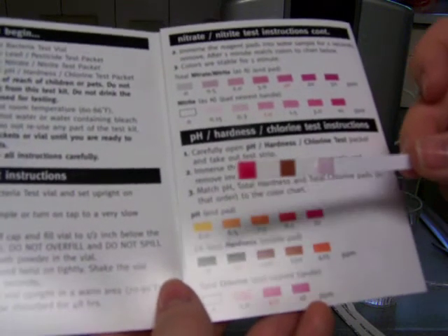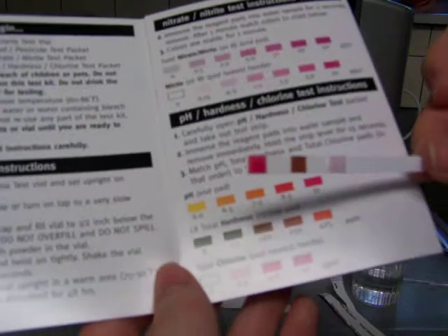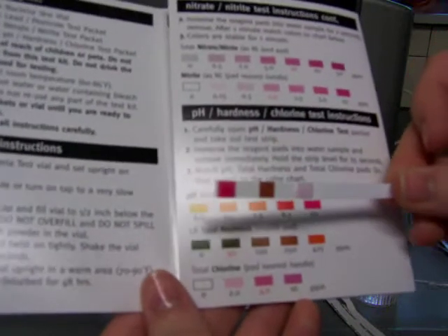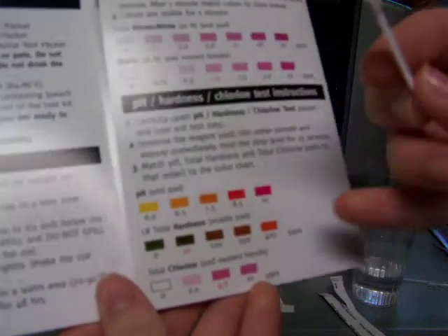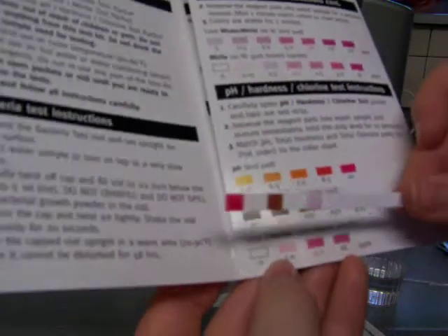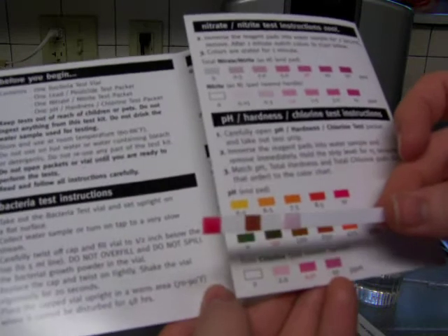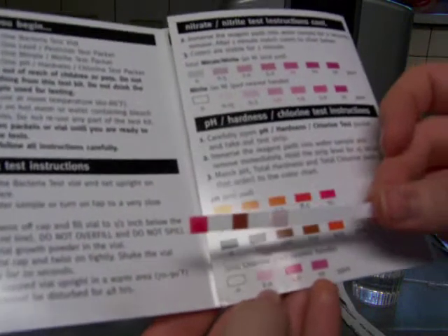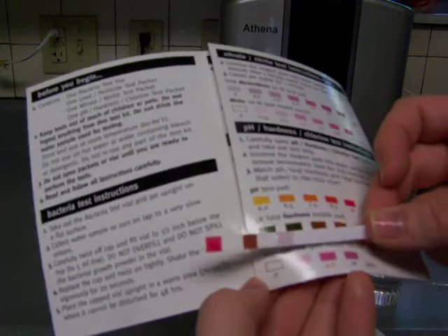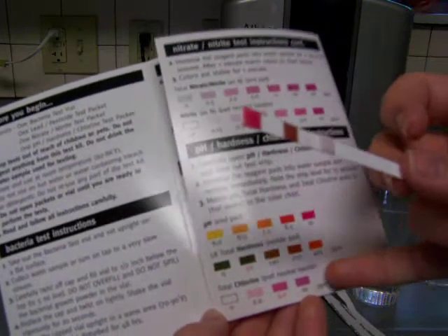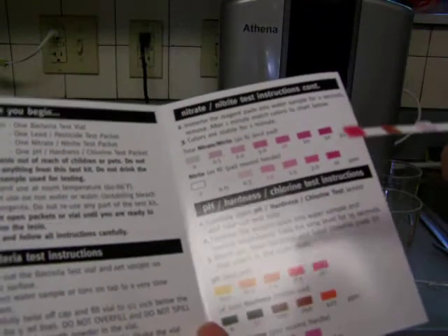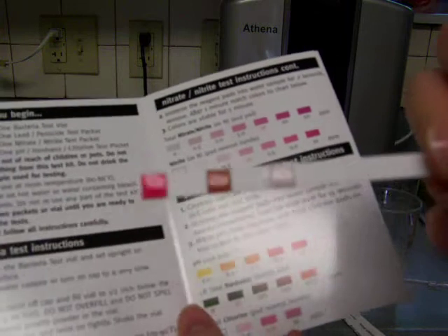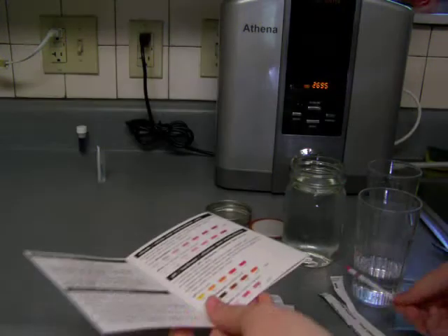And then we have hardness. And that's about 120 parts per million it says. So that's not particularly hard, but it's not soft either. Okay, and then the chlorine here is a light pink. So I'd say that's a 2.0. It's probably actually between 0 and 2.0, so maybe 1 parts per million. So that's how much chlorine is in the water. It's not that bad actually. But there you go. That's the results for that one.